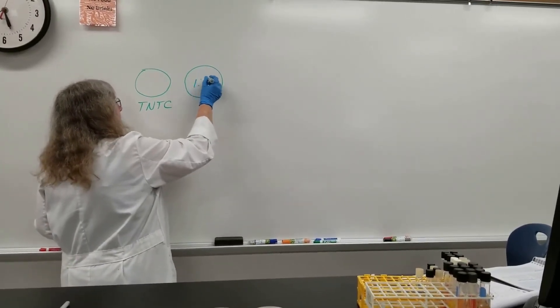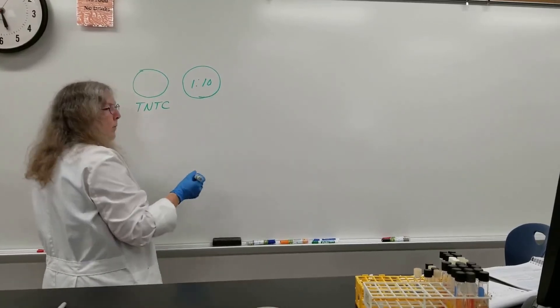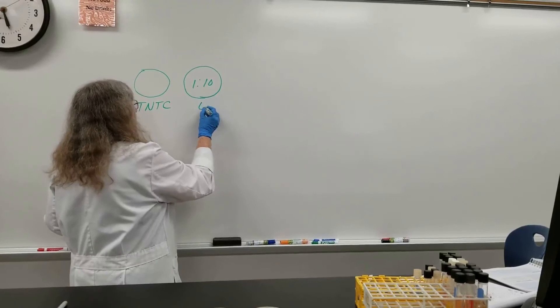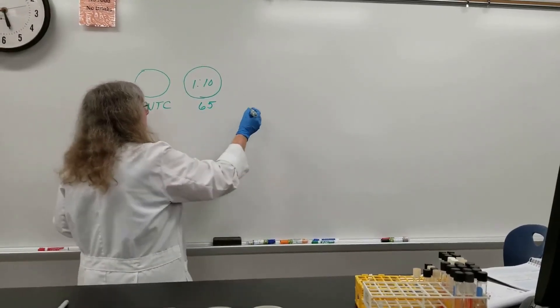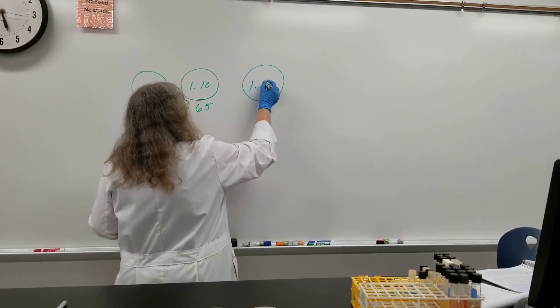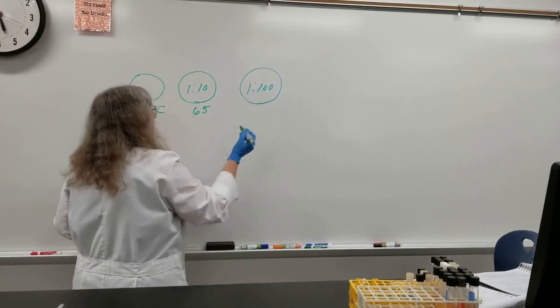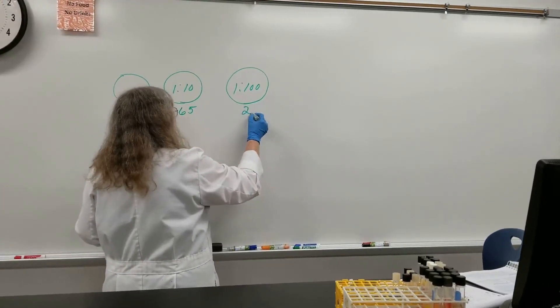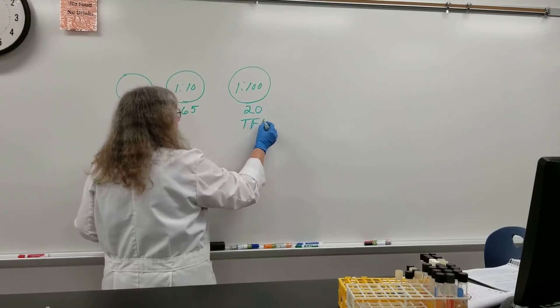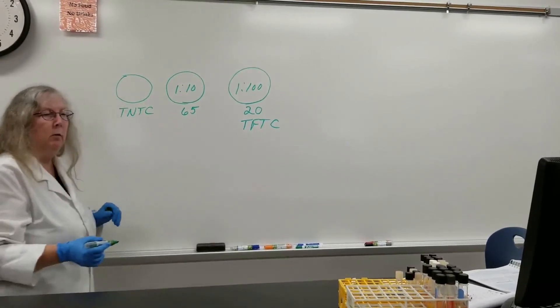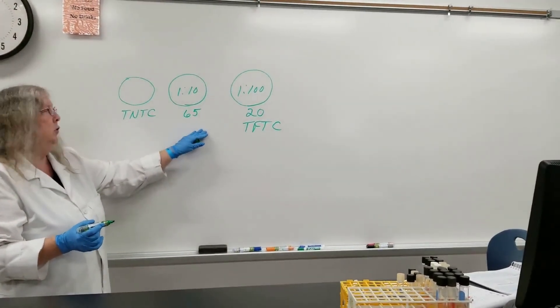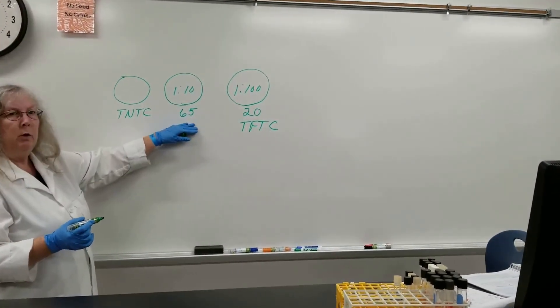Now this plate was a 1 to 10 dilution and we previously counted this plate and had 65 colonies on it. The 1 to 100 plate only had 20 colonies on it. This will sometimes be recorded as TFTC, too few to count - it's less than 30. So we were able to hit, with our dilution, hit this range of between 30 and 300.